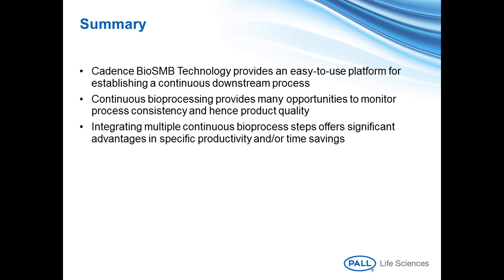So that's what the BioSMB system allows you to do. Meanwhile, it does maintain some sort of data integrity, simply because it does not only store the raw data, it also stores in the result folder the method as you've actually run it, so that should you choose to modify that method, at least you've always saved the method as you run it. That's a part of data integrity that has helped us a lot, since we always manipulate methods after we've used them. This protects us from those.